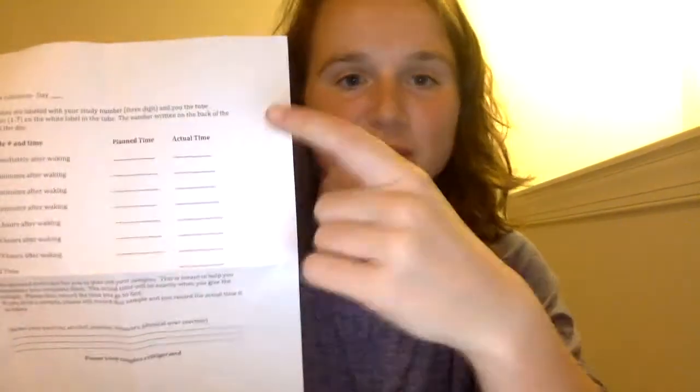I need the actual time to do the calculations to basically get the data from this. So you can plan your time out, and once you know when you wake up, you'll know what 15 minutes after it is, 30 minutes after it is, 3 hours after it is, and you can go from there. And then just write down the actual time that you take the tubes or take the sample.